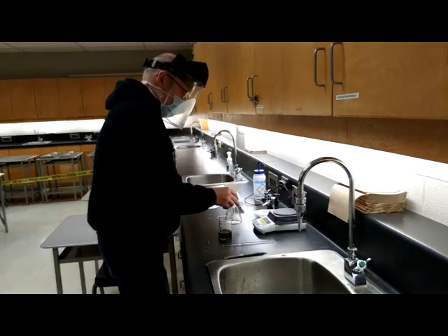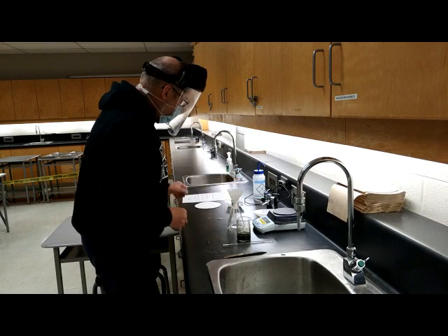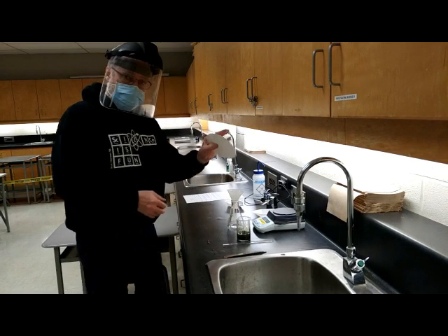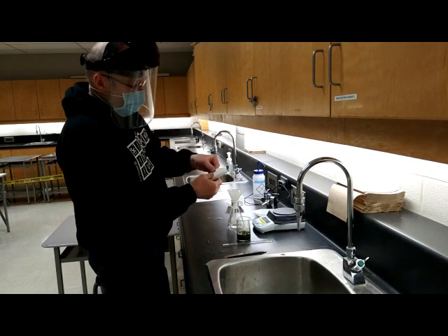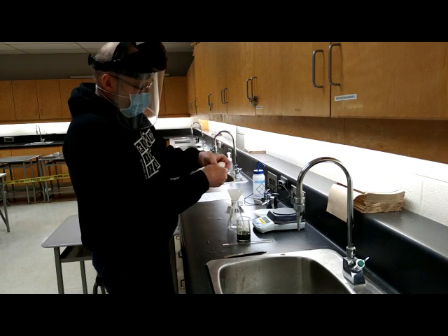Now, the next thing we have to do is filter this mess. Okay, so this is going to now get filtered to recover the copper. And so we're going to use our filter paper. And so the way this works, we fold that in half. We fold that in half again.